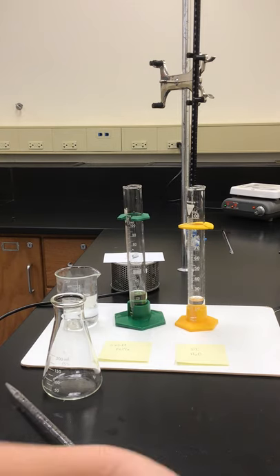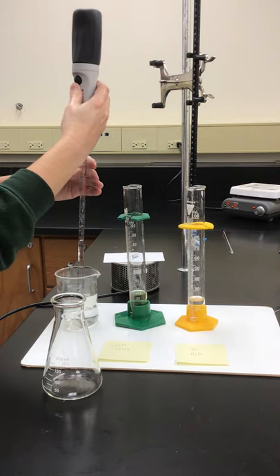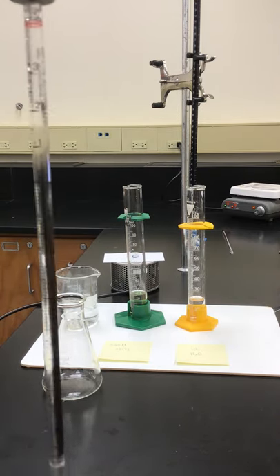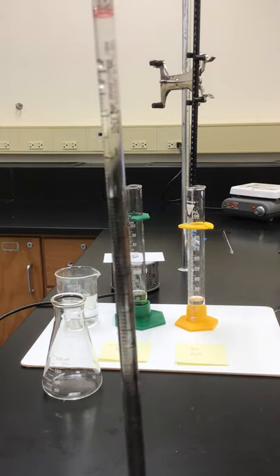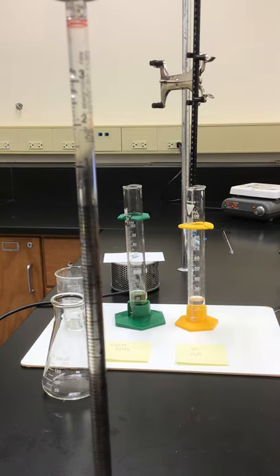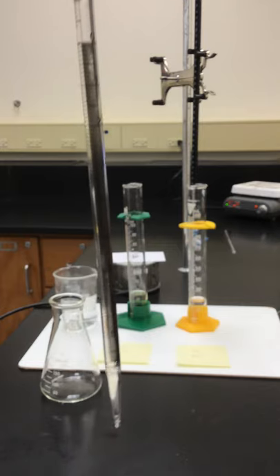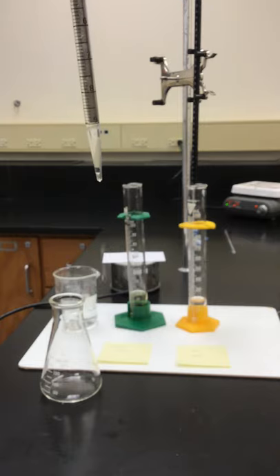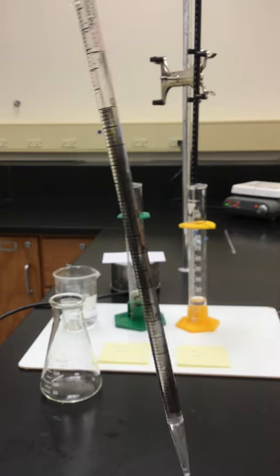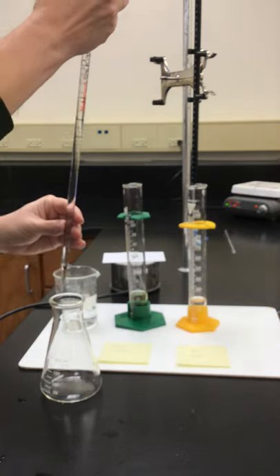I'm going to pipette a 10 milliliter portion of this hydroxylamine. The markings are a little funny — just a reminder, let me hold this close so you can see. The markings go negative two, negative one, then zero, and then all the way down to nine at the bottom. So I'm going to go between negative one and nine — that'll give me my 10 milliliter portion.